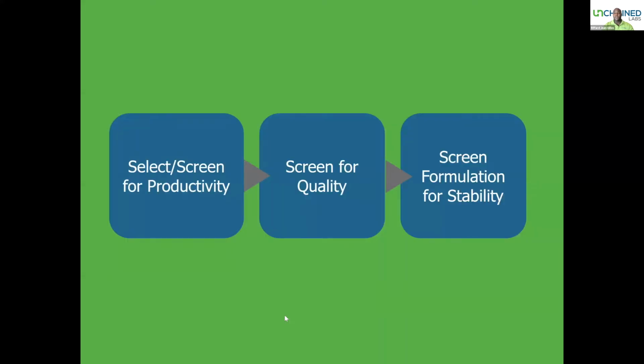So here are three of the initial stages that you can think about when it comes to antibody development. So initially you have essentially a screening that happens where you do some ligand binding, and you're trying to essentially do some functional assays where you're trying to assess how strong of an interaction that you have. You're then going to look for essentially quality, right? How good of a sample do you have as you go through different formulation screens and trying to assess whether or not your protein is still folded and whether you have any aggregation present as you do so, okay?